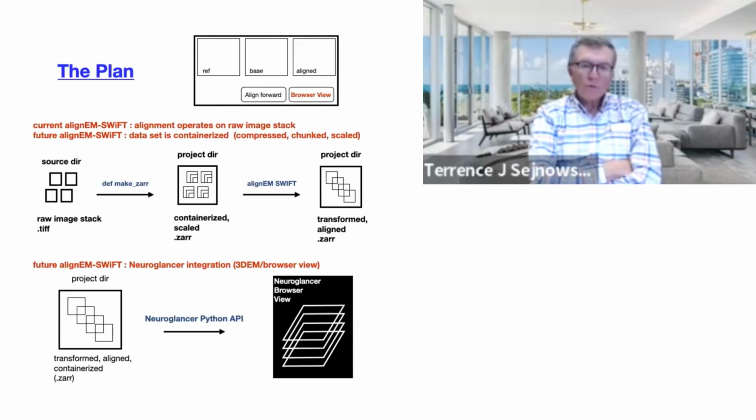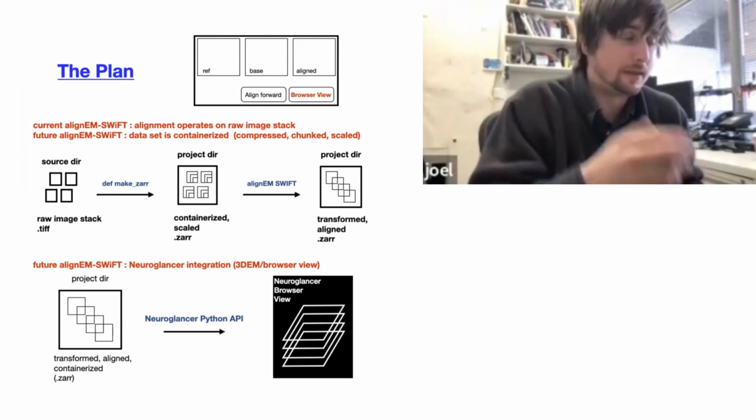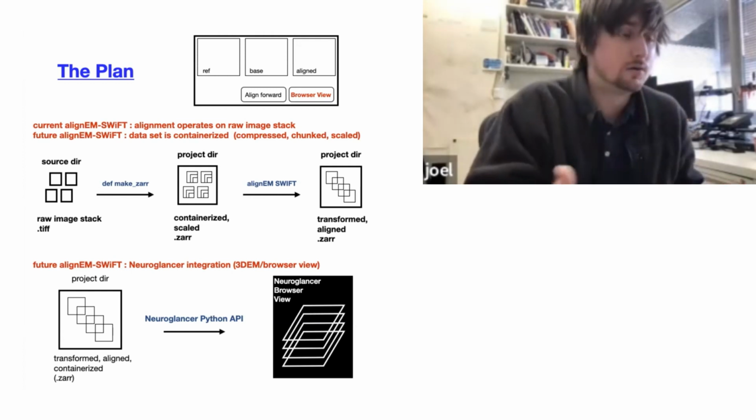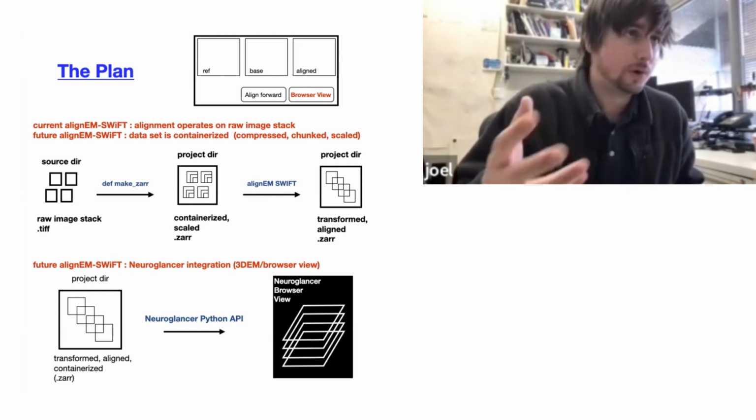Joel. Yes. So it sounds like this is redundant. I mean, the metadata, Kristen keeps it in an Excel file, and so you're saying it will obviate her Excel? Well, the metadata is also accessible from the command line, so we can write code around the attributes file. So we can work with objects.